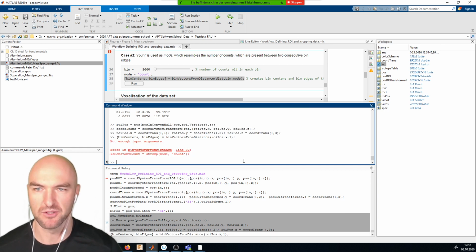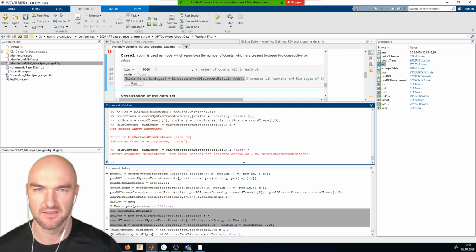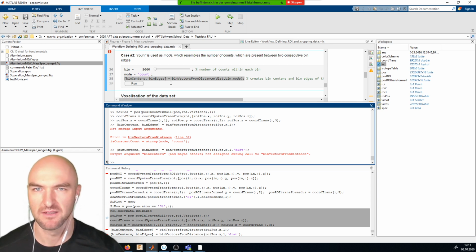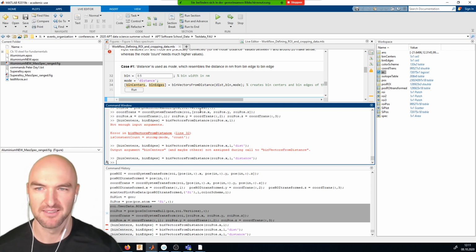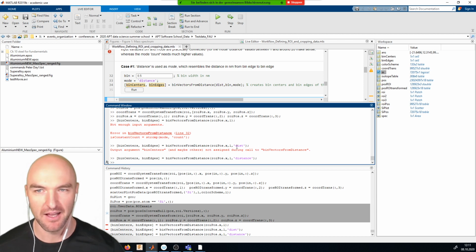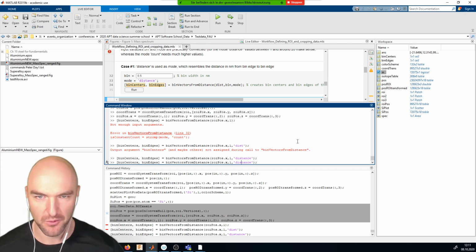So I don't type anything, then we'll just, sorry, maybe I need to type something. Did I do something wrong? Mode equals distance, ROI pos dot x. Thank you. Needs to be distance, not dist. Thank you, Valentin. And with that, what I get now is a cell array, which only has one entry. So we get to that later when we do multidimensional analysis.